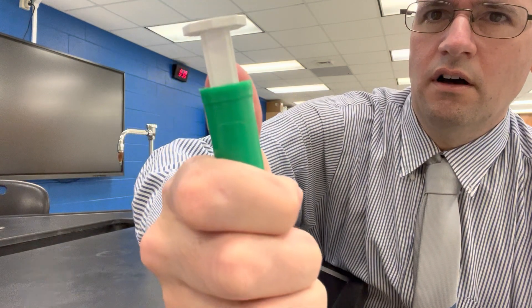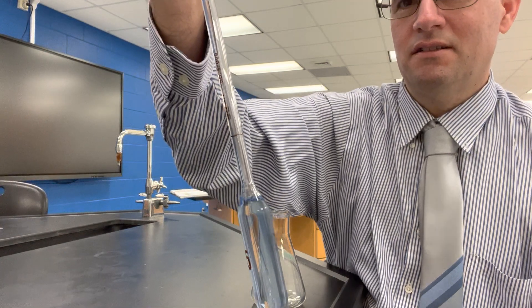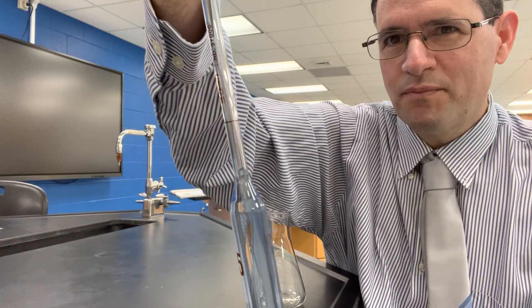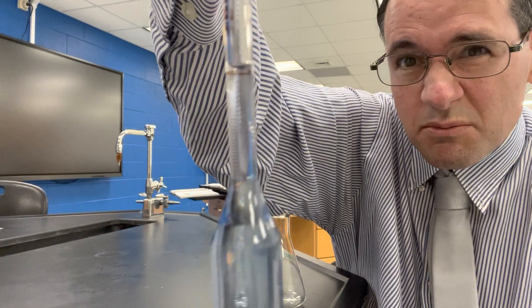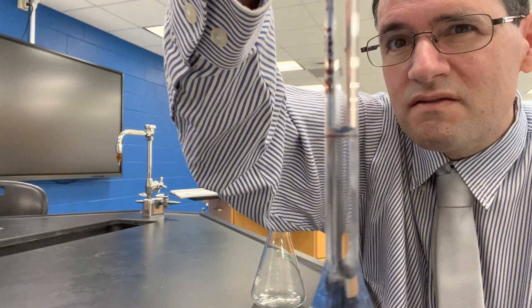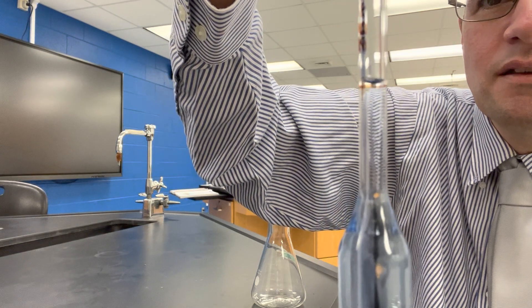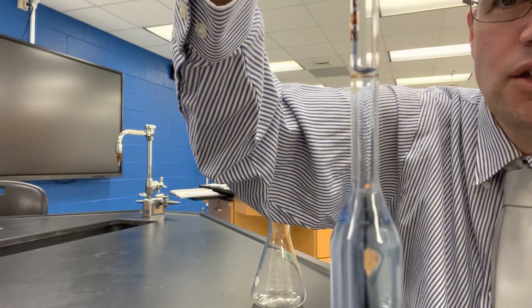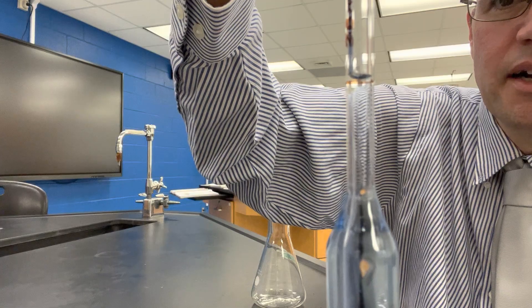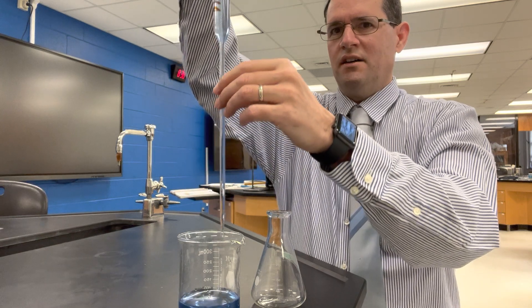Be careful — don't yank back on the wheel really fast because the liquid could rise so far that it goes into the plunger, which would cause a problem. Slowly bring it up to the meniscus. Remember, the meniscus is the bottom part of the U-shape, and you want that to be just above the line.